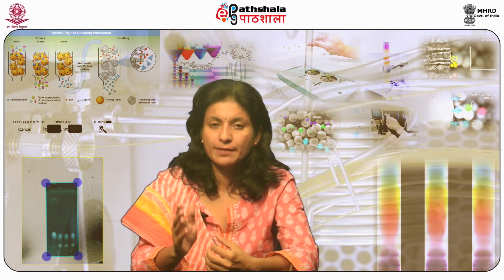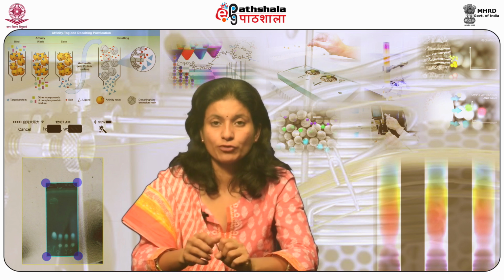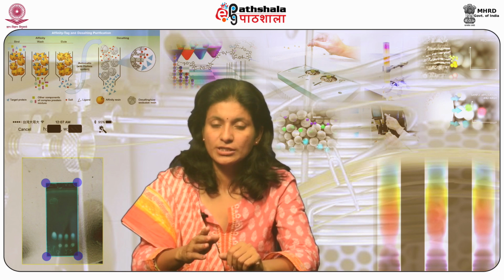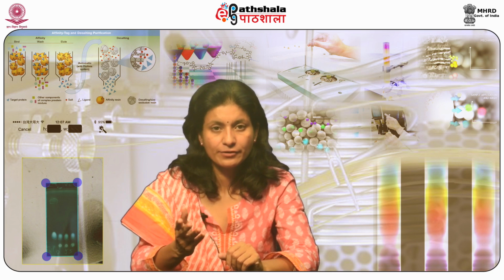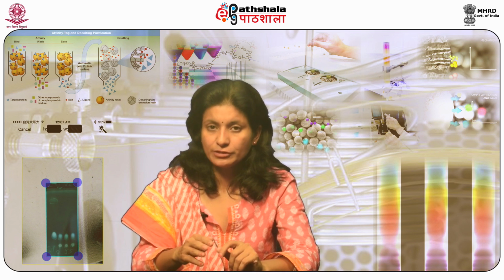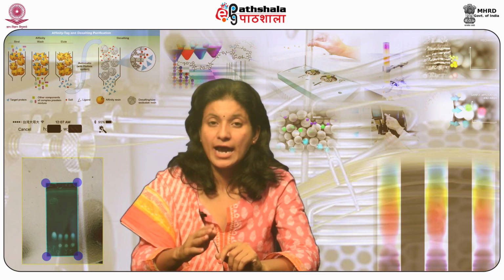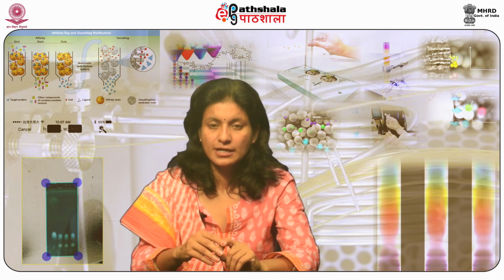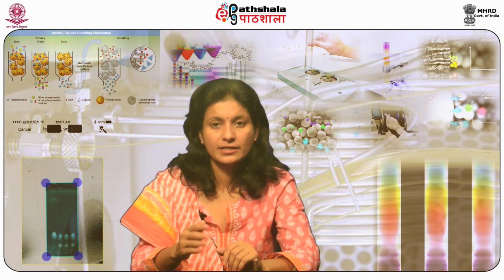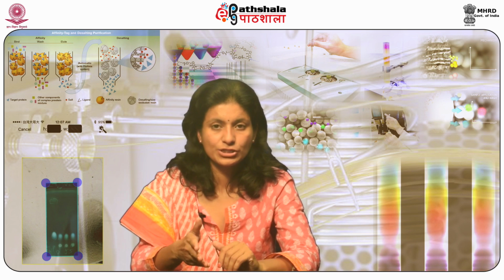Similar types of molecules that would be difficult to separate by other techniques due to the charge carried by the molecule of interest can be easily separated by changing buffer, pH, etc. Ion exchange chromatography is a vital analytical technique for the discrimination and segregation of ionic compounds, in alliance with ion interaction or partition and ion exclusion chromatography.